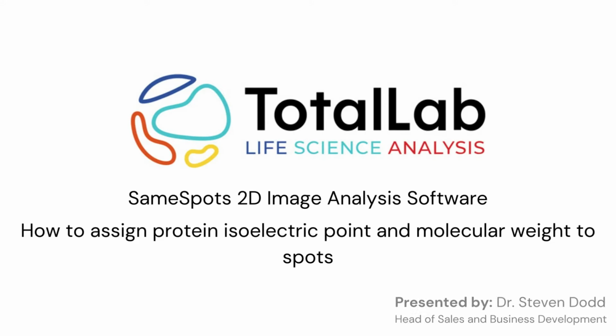Hello everyone. Today I'm going to be showing you how we can import isoelectric point and molecular weight markers into our 2D images to help identify the isoelectric point and the molecular weight of some of our spots of interest.